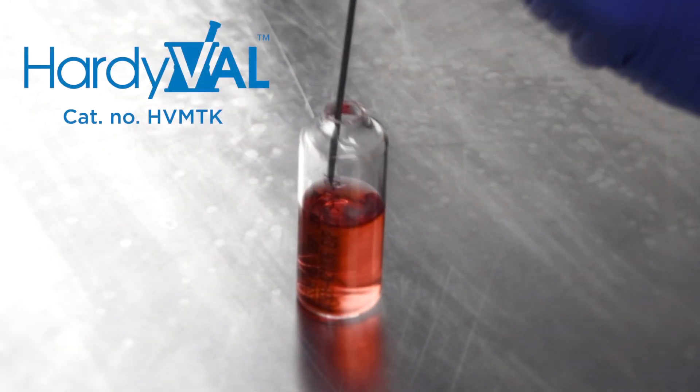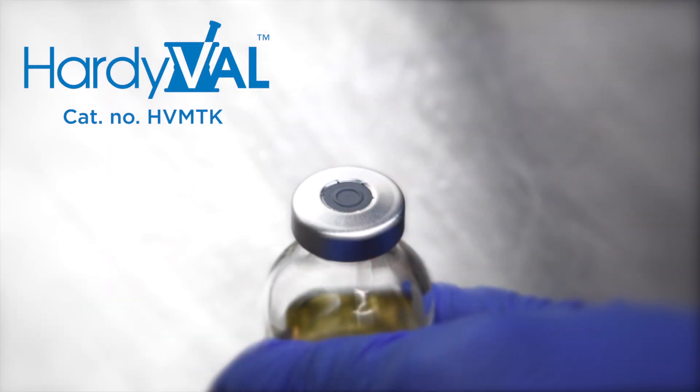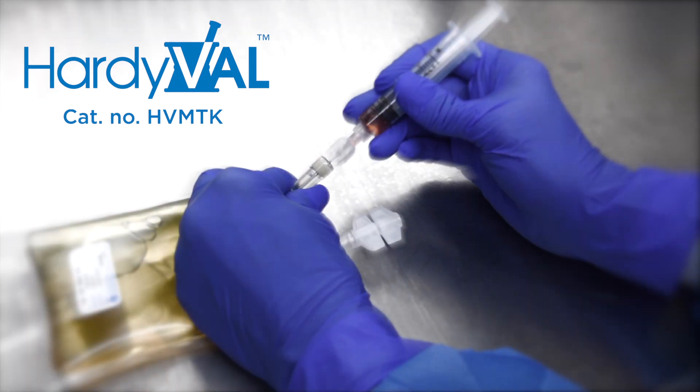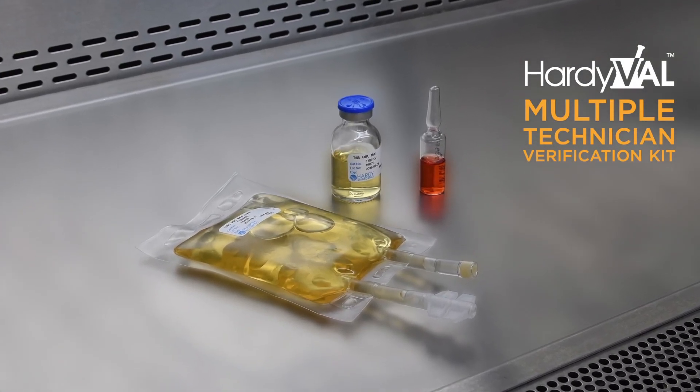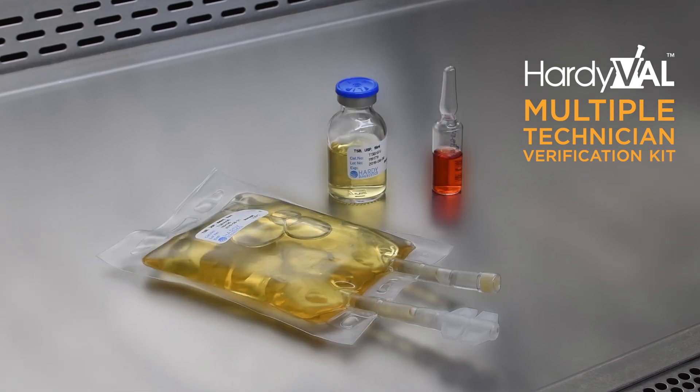The Hardival Multiple Technician Verification Kit is recommended for verification of personal aseptic technique for low and medium complexity levels within a sterile compounding pharmacy or other clean room applications. HVMTK may meet your compliance standards if your facility is compounding with solutions from ampules, bags, and vials.